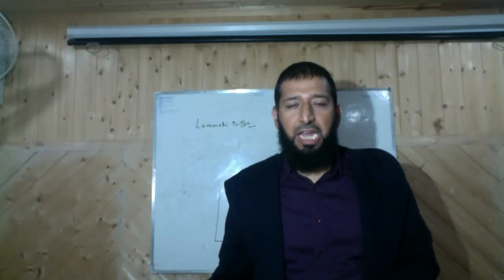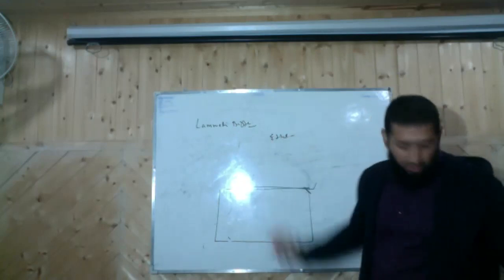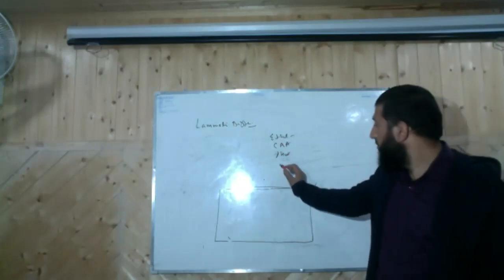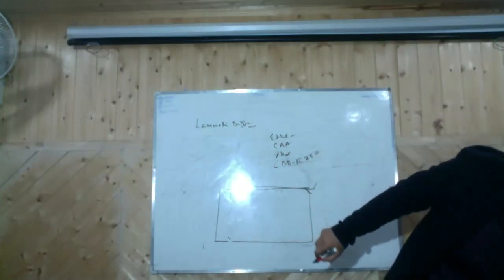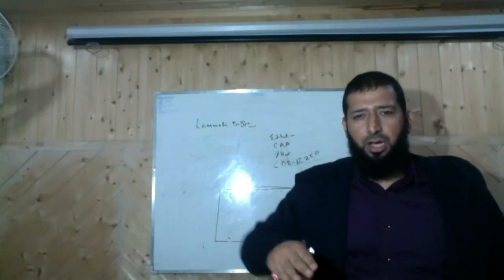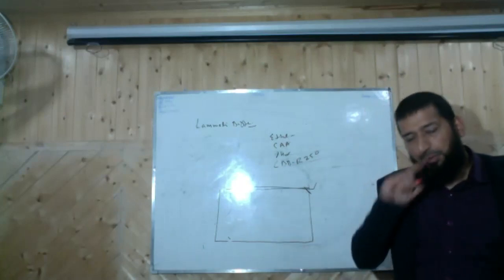So what we do, we put this gel in a staining solution that comprises of ethanol, plus glacial acetic acid, distilled water, and then you have Coomassie Brilliant Blue R250. So you put the gel in this solution for a while, say 20 minutes, 30 minutes, or 1 hour. Then you keep it on a rocker so that it rocks and the Coomassie Brilliant Blue reaches every protein. So after that, you will see that the whole gel has become blue. You'll not be able to see your protein bands.